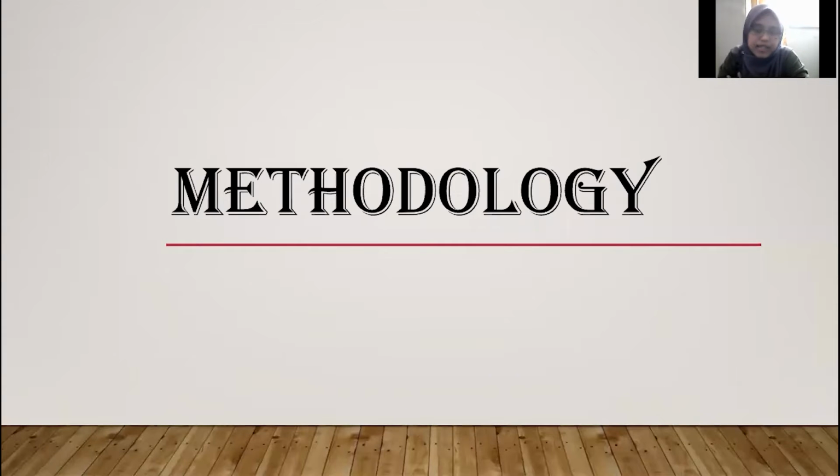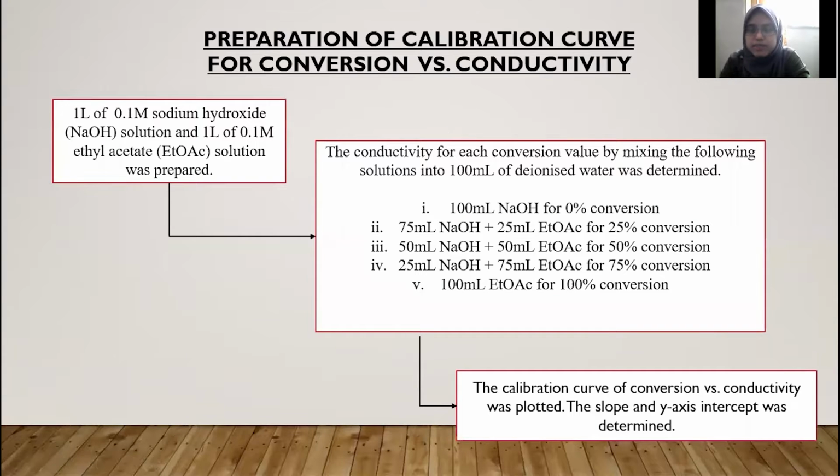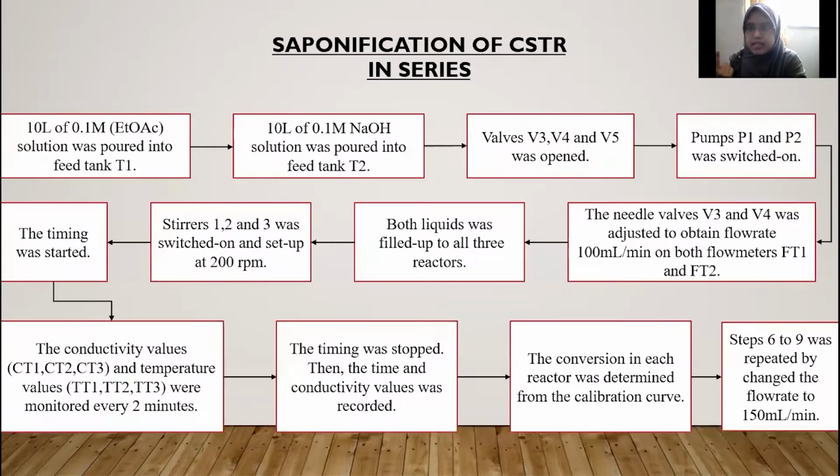Hi everyone, I am Nur Fazana bint Yusuf. My ID number is KH20031. For my part, I will present about the methodology of this experiment. First, we need to do the preparation of the calibration curve. And second, we need to do the saponification in CSTR in series.